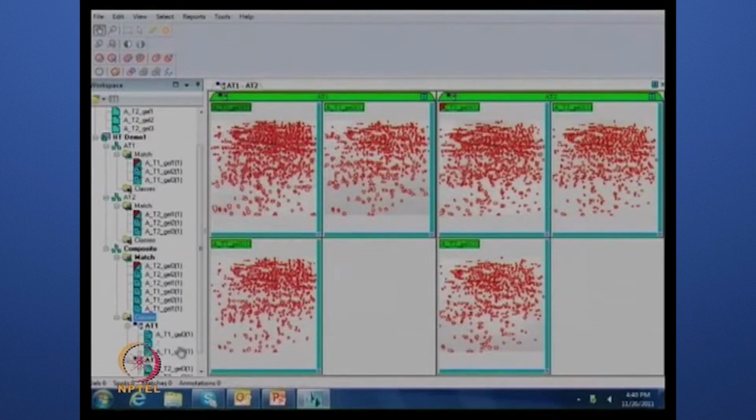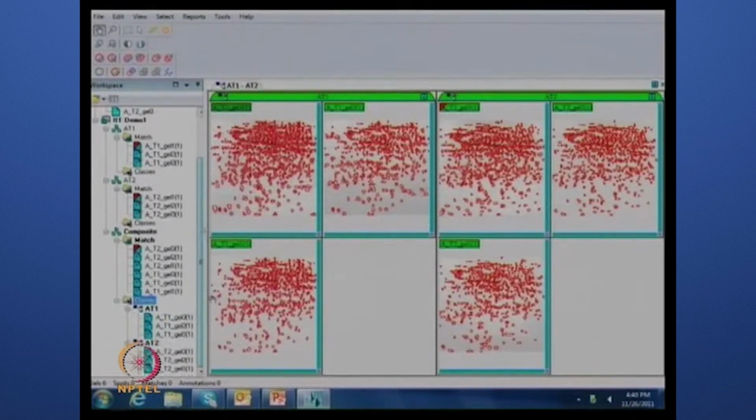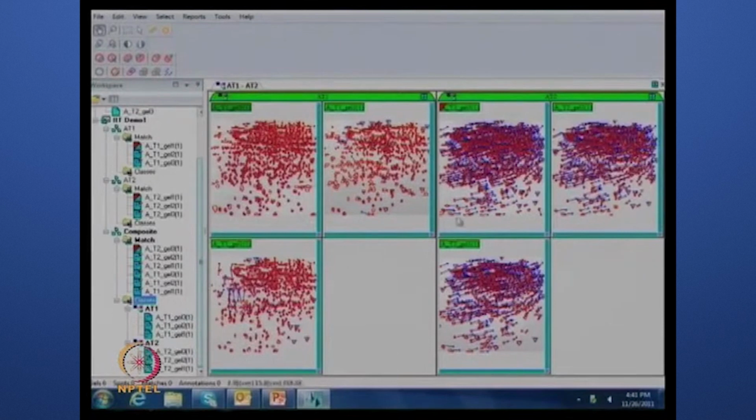Once you have done the same thing, then quickly match them again. One can remove all these vectors by adding our particular landmark again. This is the same process we did earlier. Now go to reports, where you can see the analysis classes.